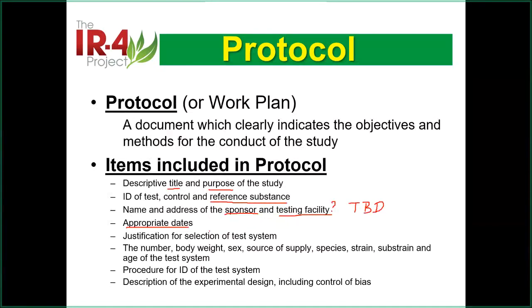I'm not going to go through every single detail because it's really a lot. You will get this PowerPoint slide probably later, but you can read them, or you can simply pull out the GLP, and the easiest one just to get is IR4 protocol. Any protocol, you will find exactly the same information there.